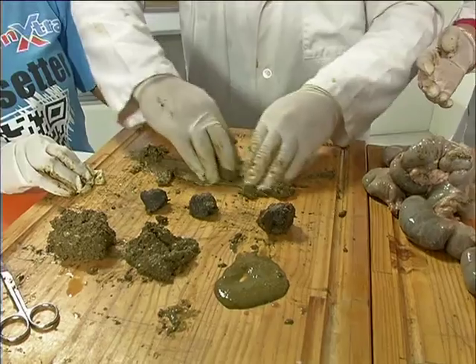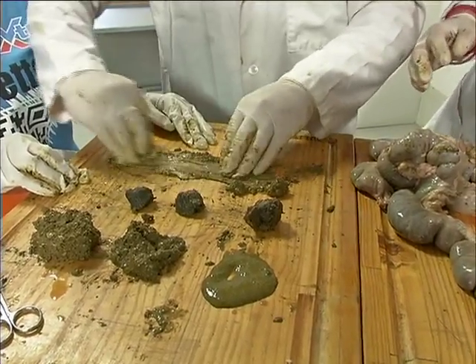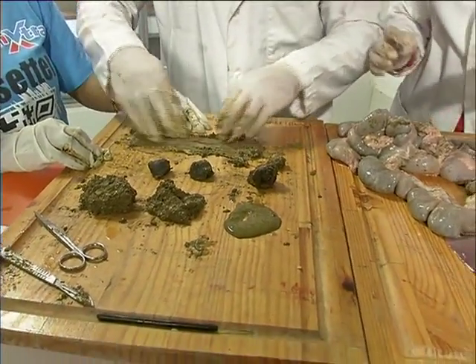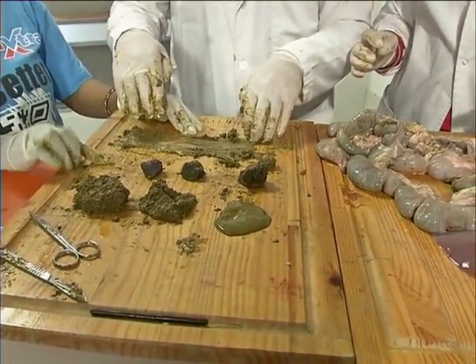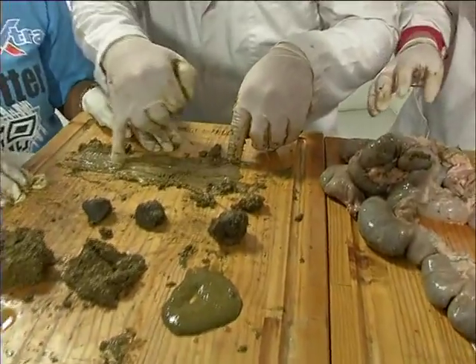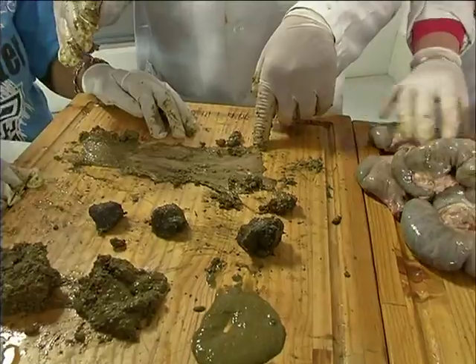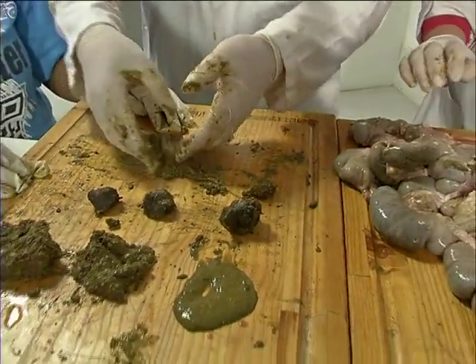And look. Oh, wow. I had to pick the one that stinks, didn't I? Yeah, you did. Well then. You must keep checks on these things. Check if it went to the toilet. Also, yeah, no. Still got that skin in. This little piggy definitely didn't go to the bathroom before you go. So that is the large intestine.